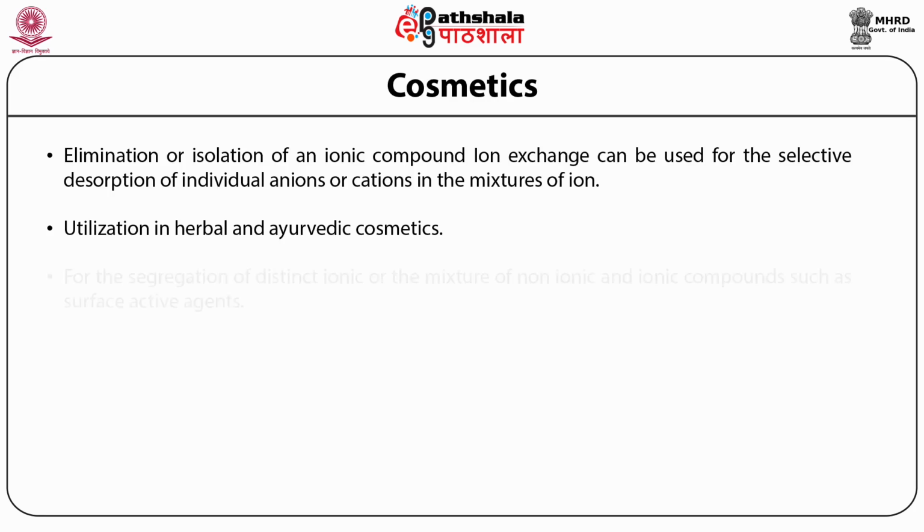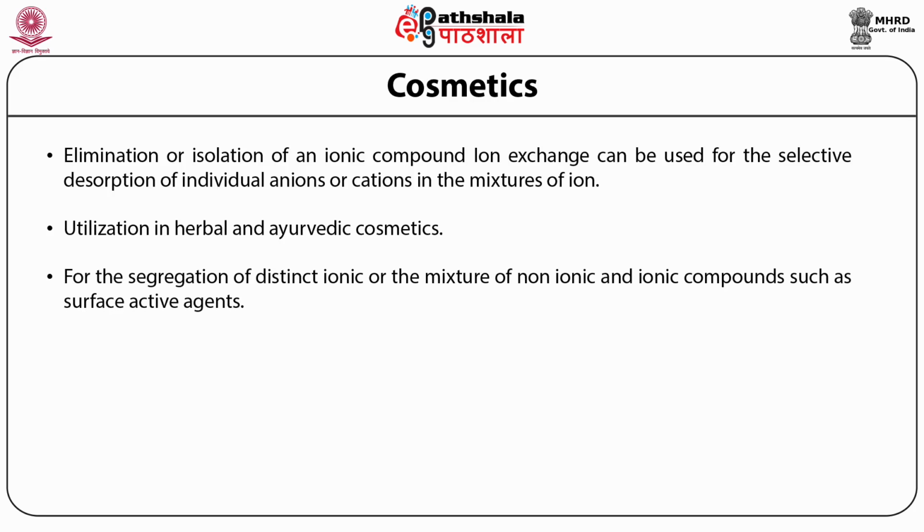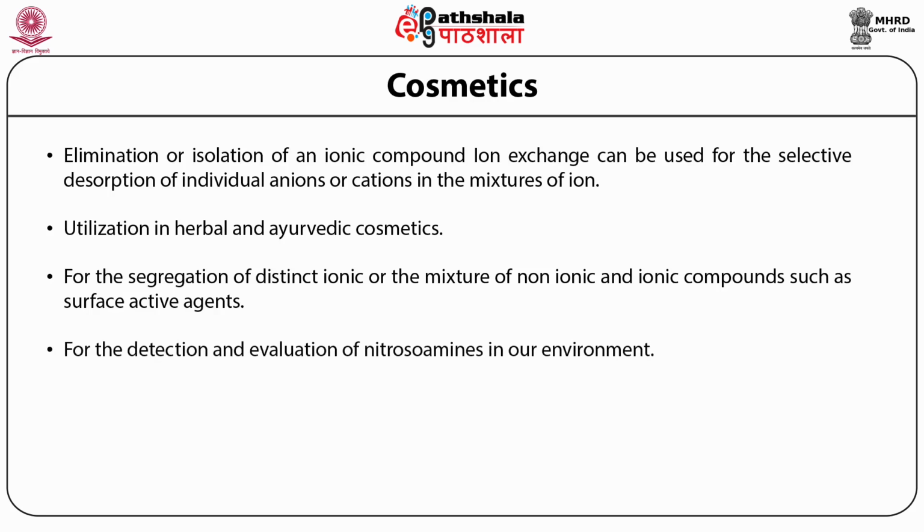IEC has been used for the segregation of distinct ionic compounds or mixtures of non-ionic and ionic compounds such as surface active agents. It is a highly sensitive technique for the detection and evaluation of nitrosamines in our environment. NDELA in cosmetics is an impurity in samples of cosmetics. It is adsorbed by strongly basic anion exchange resin. IEC facilitates the cleanup process of cosmetics by recovery of various other compounds utilized in formulations of cosmetics.